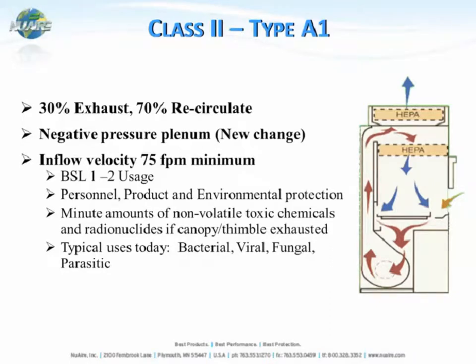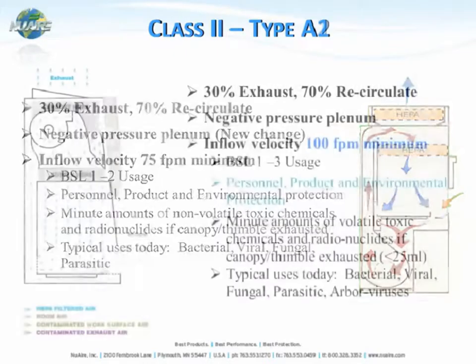The Class II Type A1 cabinet provides personnel, product, and environmental protection. Because it's only providing 75 feet per minute of inflow velocity, you can use it for minute amounts of non-volatile toxic chemicals if it is exhausted to the outside. A1 cabinets are not typically found very much in today's laboratories.